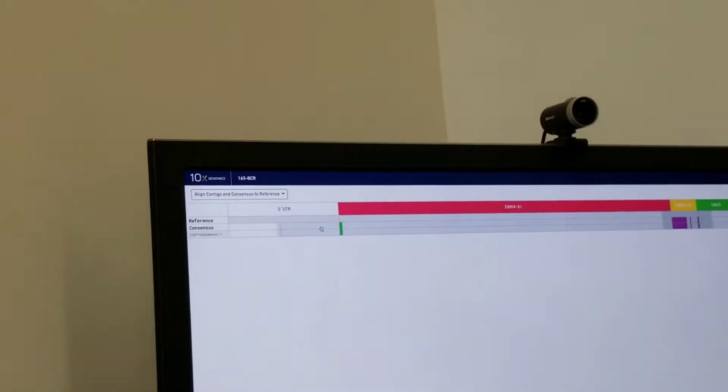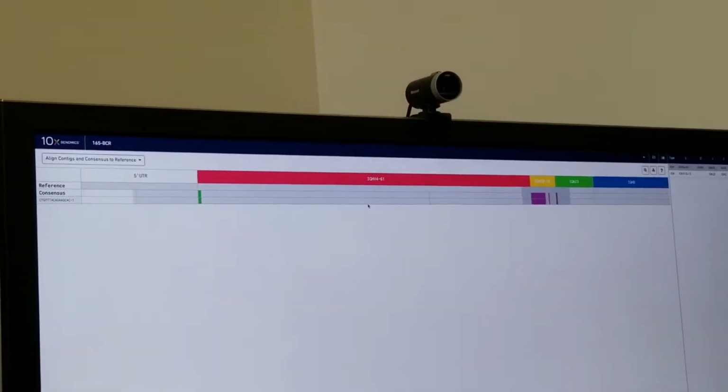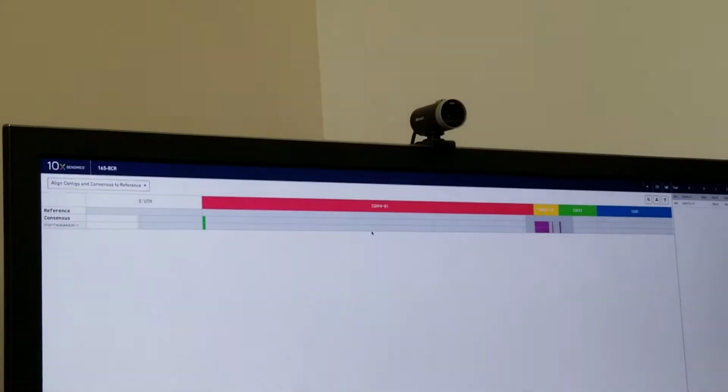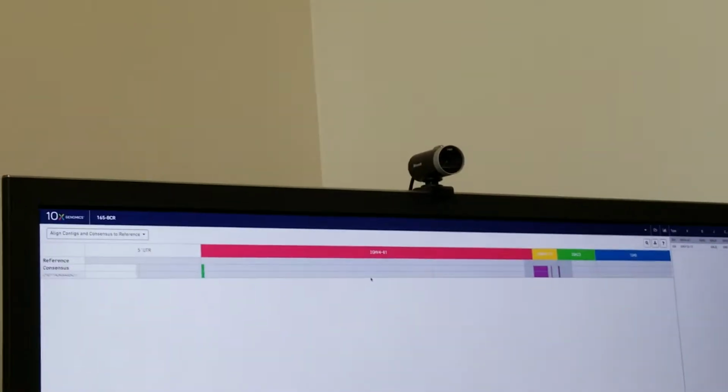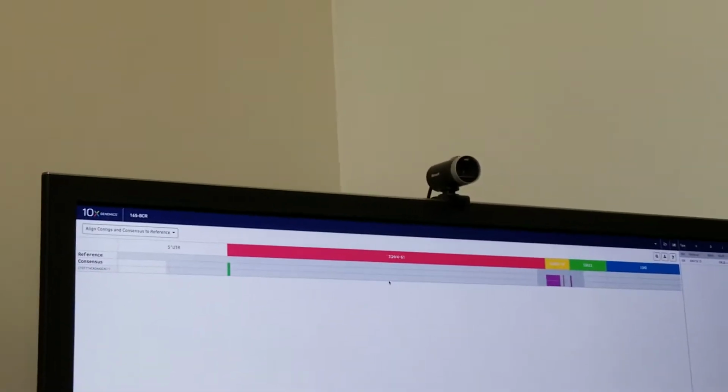Now I'm wondering about the reads. I need to look to see how it's reporting that, because I did not see that deletion, but maybe it's using this as a reference now. I have to go look. Okay, so we might not clone this one, but maybe we'll start with 20, and 10 might drop out because they can't find the V or the light chain or whatever. And then 5 more might drop out because we're not sure. So that's what we'll do, and we'll get the ones that work.